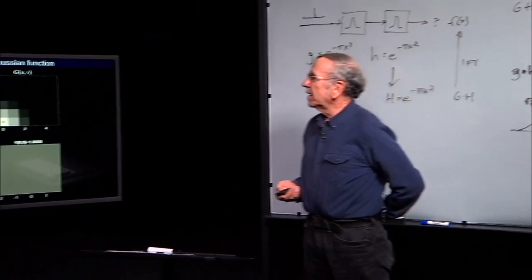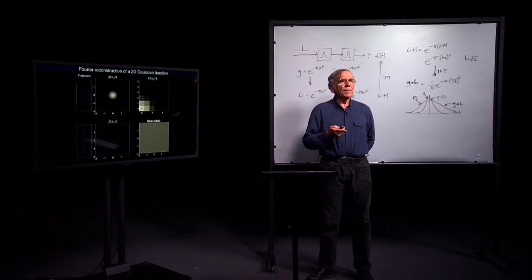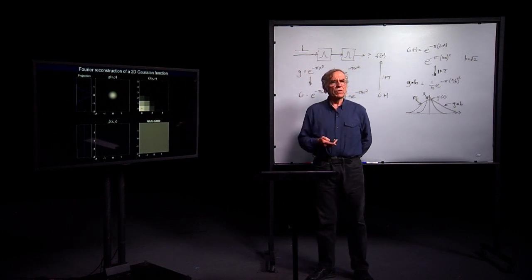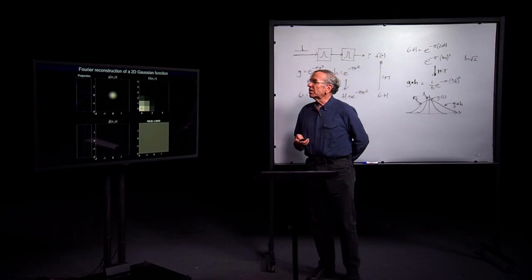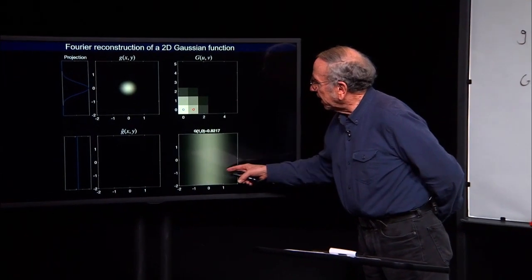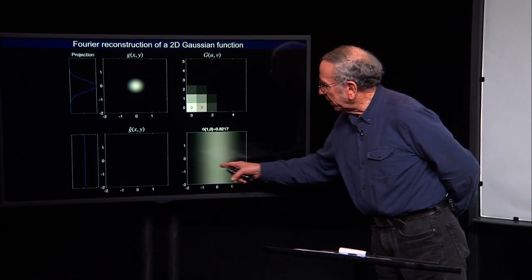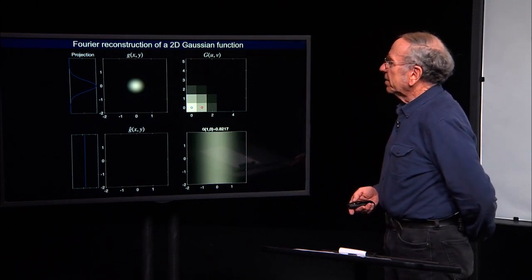Okay, so now to the content that I really wanted to talk about this time. I am now going to do the same trick that I did with the 1D Fourier transform. I'm going to try to construct a two-dimensional function out of individual cosine waves. But in this case, there are two-dimensional cosine waves, so the terms that I'm adding together are something like this. So this is a cosine that has one period in the x direction and is constant in the y direction.